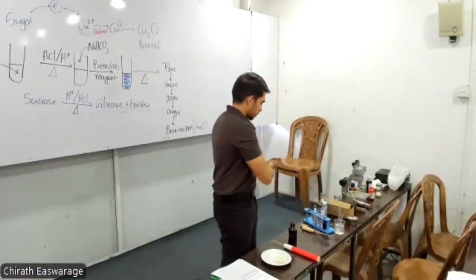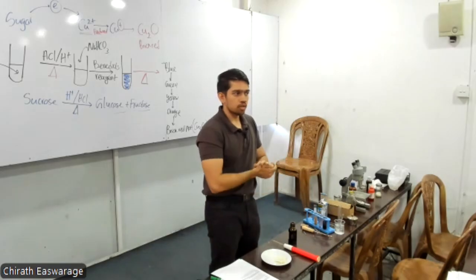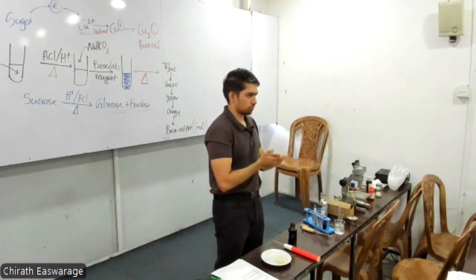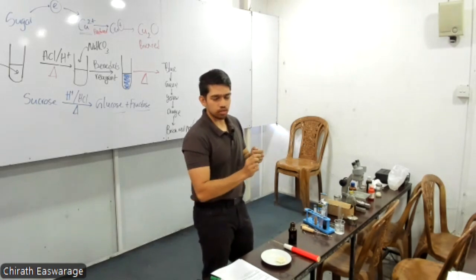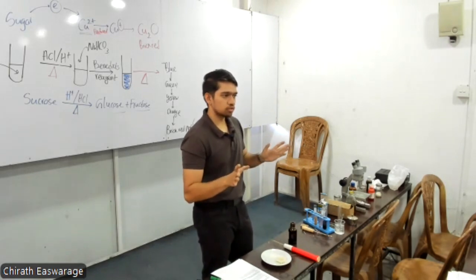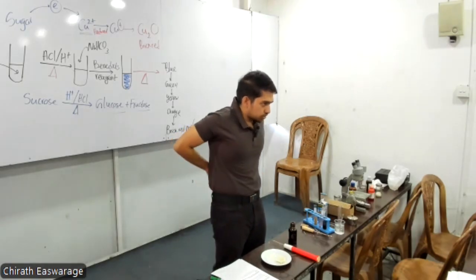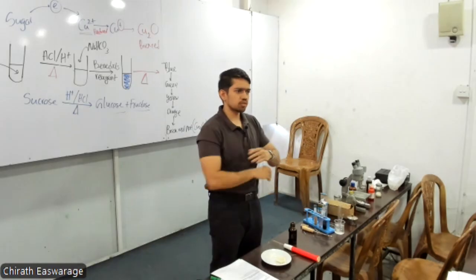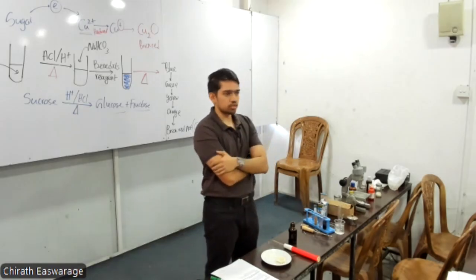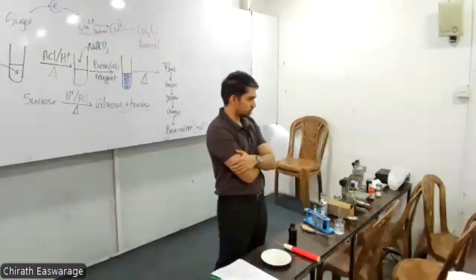We come across this starch iodine test in another practical. I'll try to do it as well. The enzyme denaturation, right? After doing enzymes, let's do that practical as well. We are going to use the denaturation of amylase. Protein denaturation is a change in the bonds that alters the functional form of proteins, right? So usually it is irreversible, no?